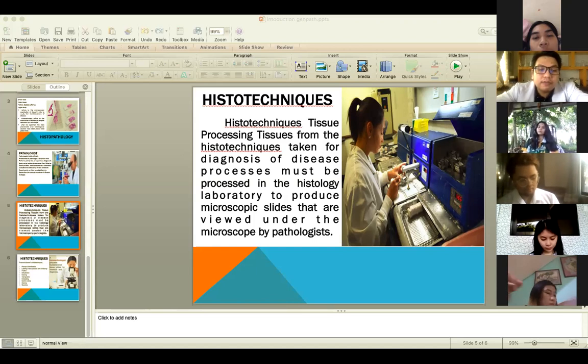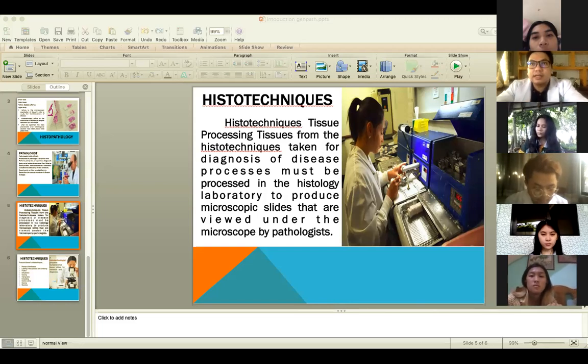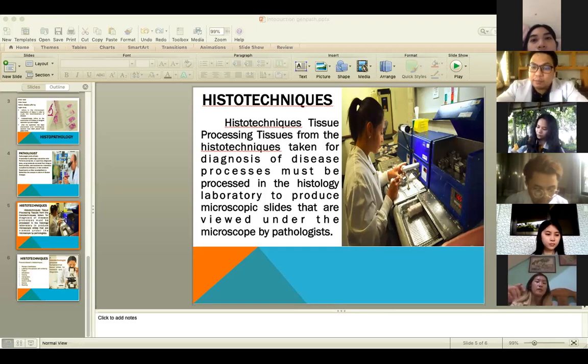While for the disadvantage, the fact that the tissues examined in a fresh state are not permanent, therefore are liable to develop the changes that have usually been observed after death. So fresh tissue, kukuha ka ng sample from the living state, put it on a slide, NSS, but you can only observe it on a limited time. Why? This will be viable lang siya for a limited period of time. After that, i-discard na kasi hindi na pwede. Okay?